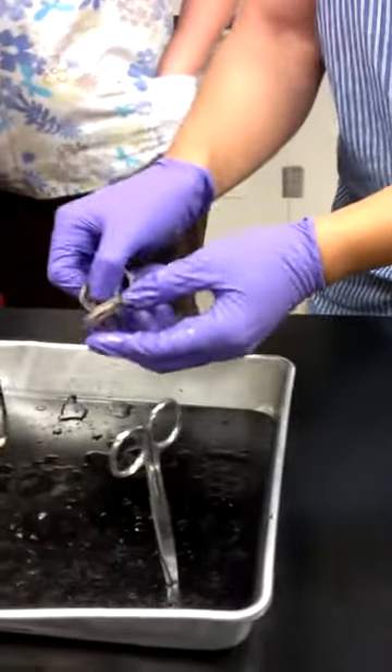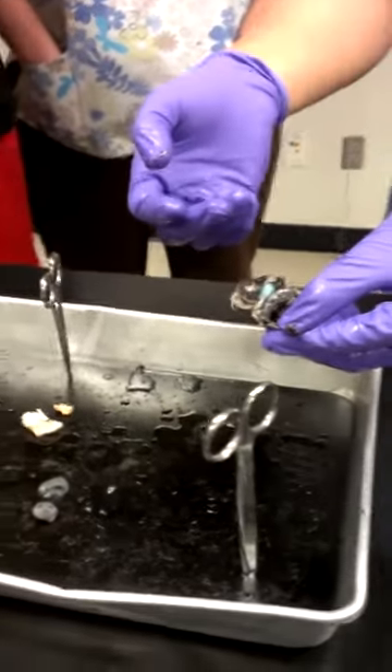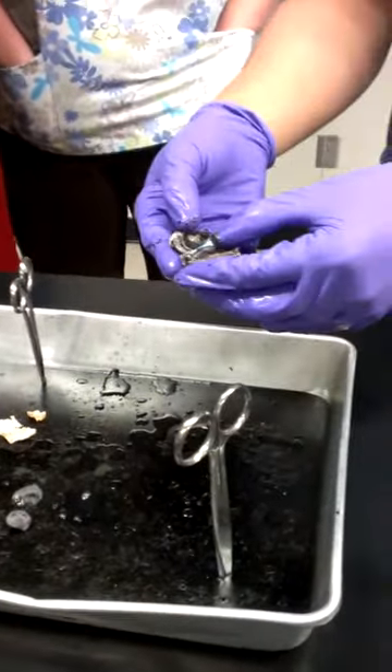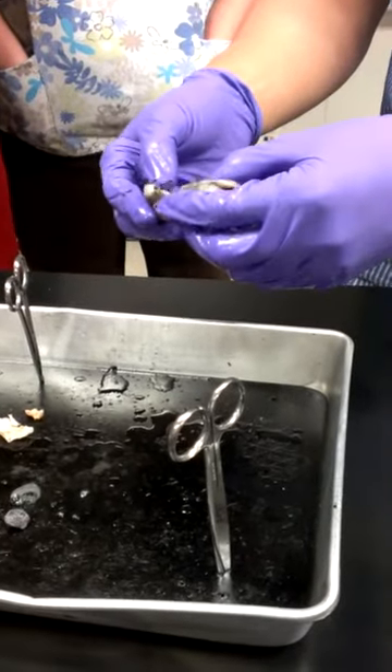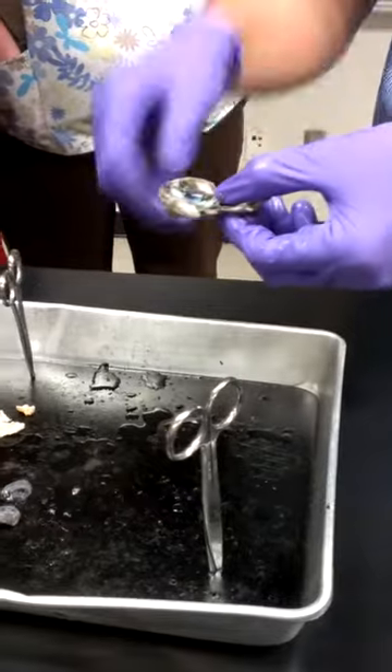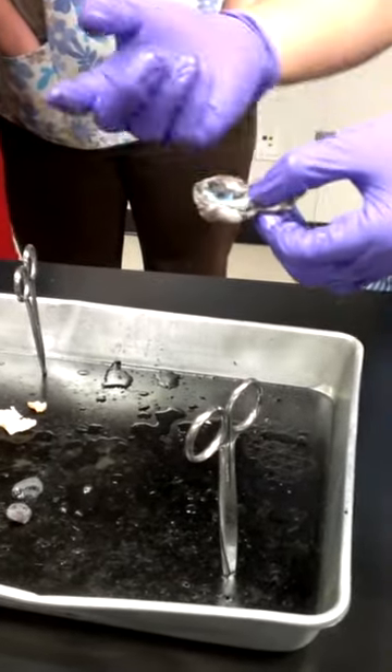If you look in the front of the eyeball, you're going to see all these black fibers — that's basically the ciliary bodies, where the lens would sit. And if you're lucky, you might be able to see the macula lutea, that yellowish region, but it's harder to see depending on the eyeball.